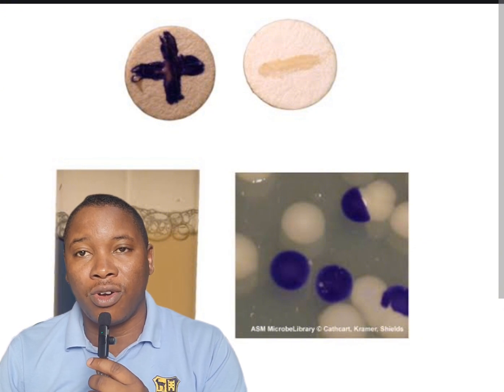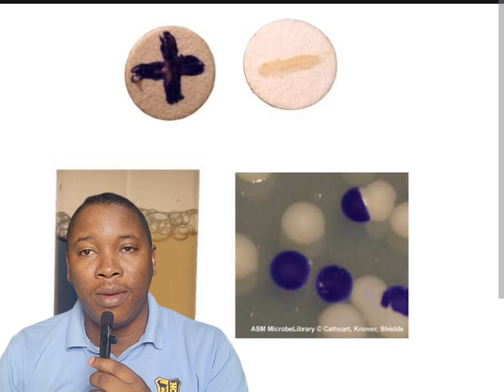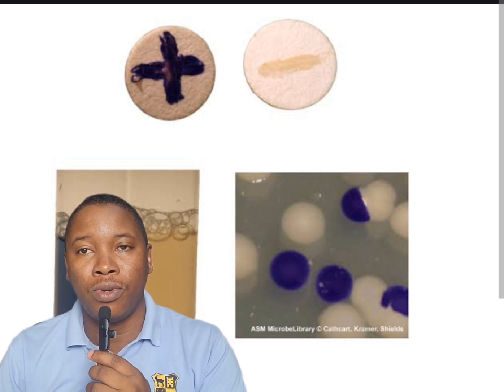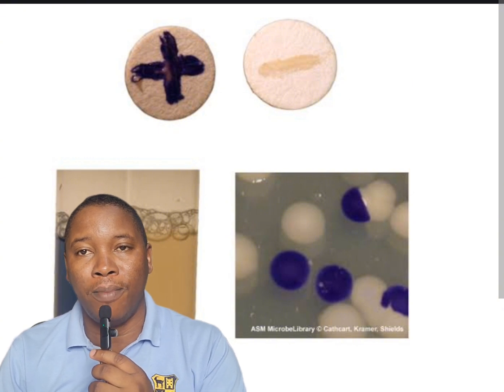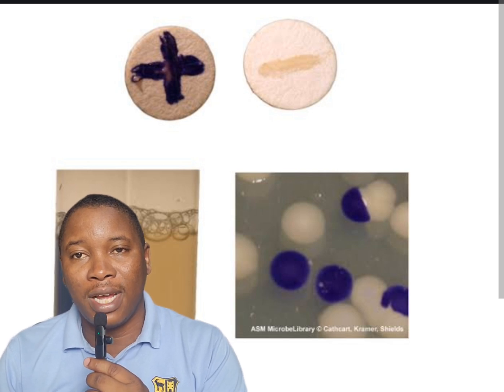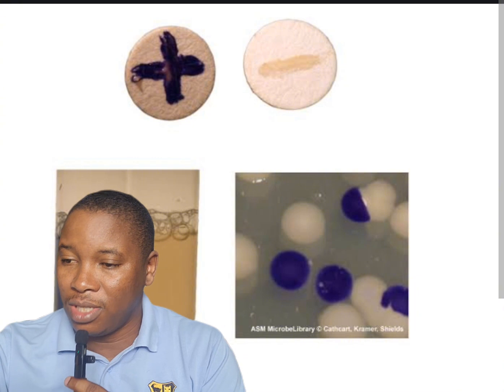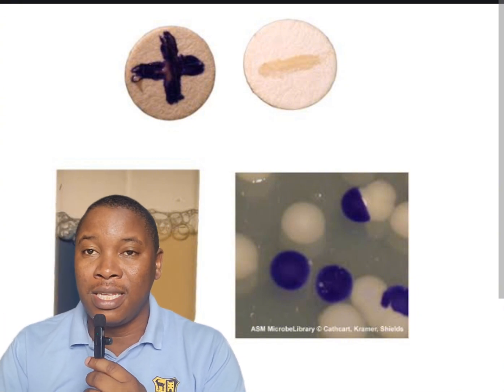If you have a change in color from that pale pink or colorless liquid, and you begin to see it turning purple or blue on your white filter paper, that's an oxidase positive result. That tells you that the organism is carrying the enzyme oxidase. A particular kind of oxidase, so cytochrome C oxidase.